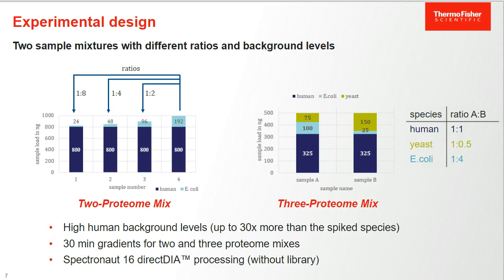The data was processed using Spectronaut 16 with direct DIA library-free approach.